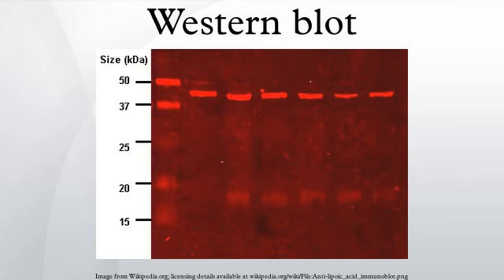Gel electrophoresis. The proteins of the sample are separated using gel electrophoresis. Separation of proteins may be by isoelectric point, molecular weight, electric charge, or a combination of these factors. The nature of the separation depends on the treatment of the sample and the nature of the gel. This is a very useful way to identify a protein.